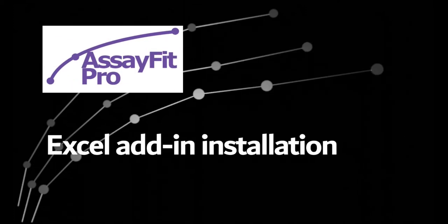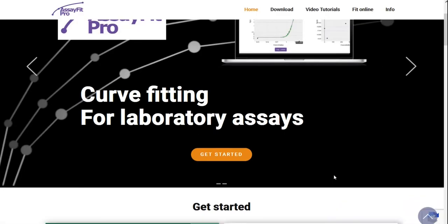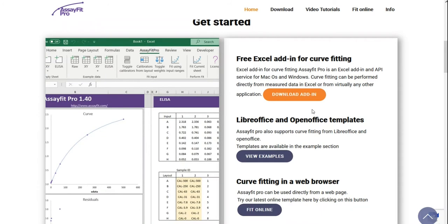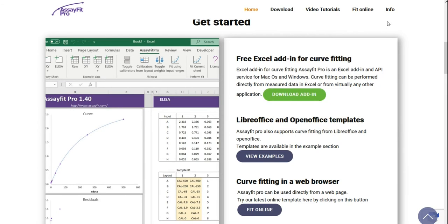This video will explain how to install the AssayFit Pro add-in for Microsoft Excel. This will be explained for a Windows and a Mac OS operating system. Go to the AssayFit Pro website and click on the button to download the add-in. Save it to your disk.